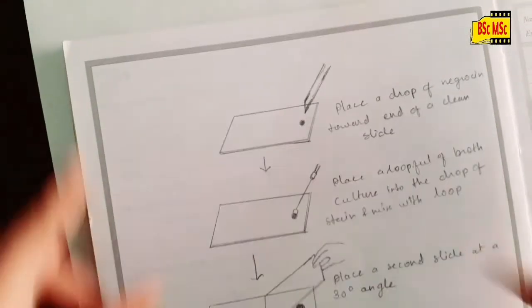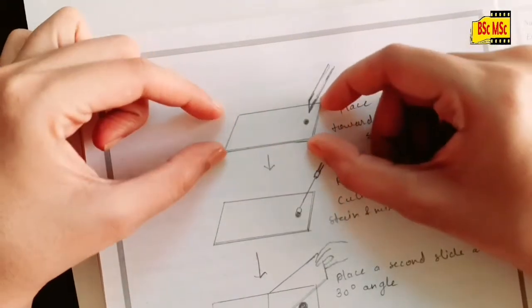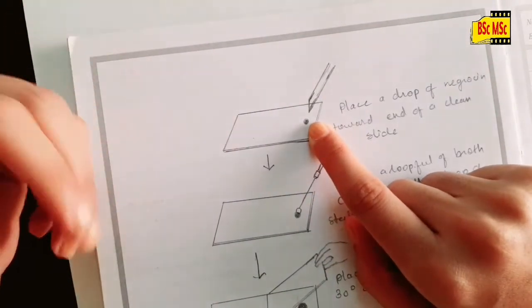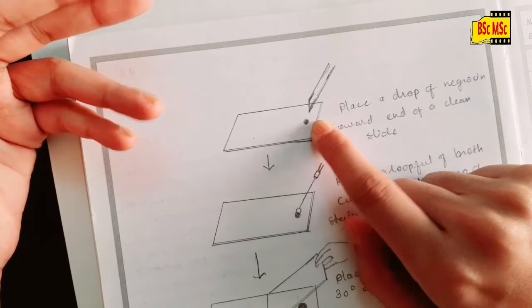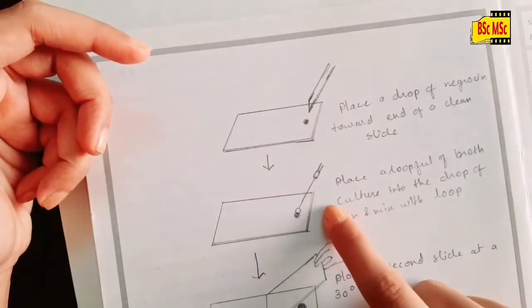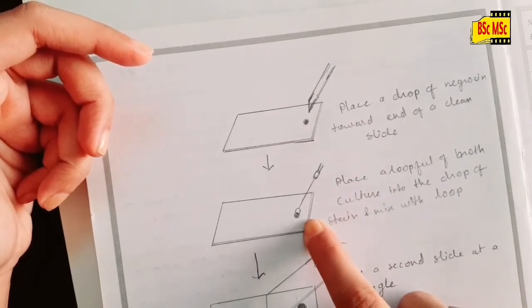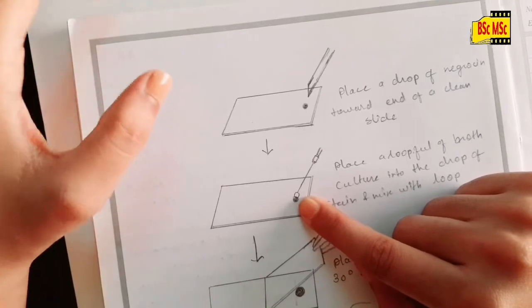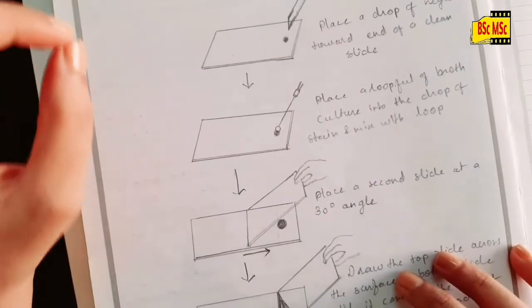I will be showing you with the diagram. You need to take the slide and place a drop of negrosine or Indian ink at the corner of the slide like this. After that, take a loopful of culture, then mix it well into the dye.